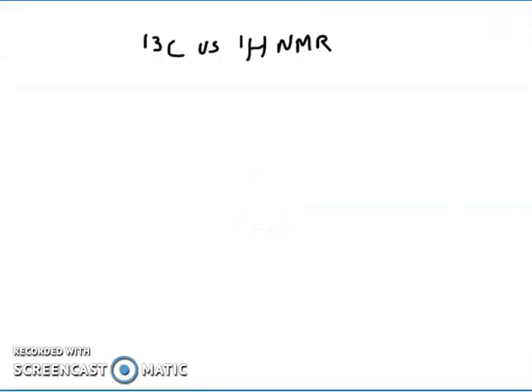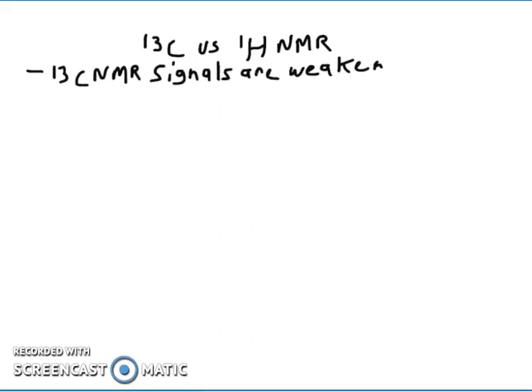I want to discuss carbon-13 NMR, and I want to start our conversation by comparing it to a technique that you may be more familiar with, which is hydrogen NMR. And there are a couple of things that I want to mention in this comparison.